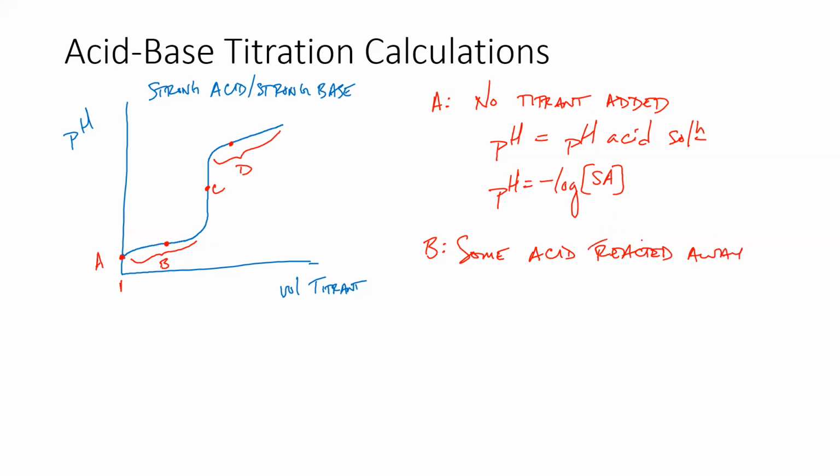Neutralized, maybe that's a better word to use. And so we need to essentially subtract the amount of base that we've added from the amount of acid that we started with. Now, there's a couple of things to take into consideration here.